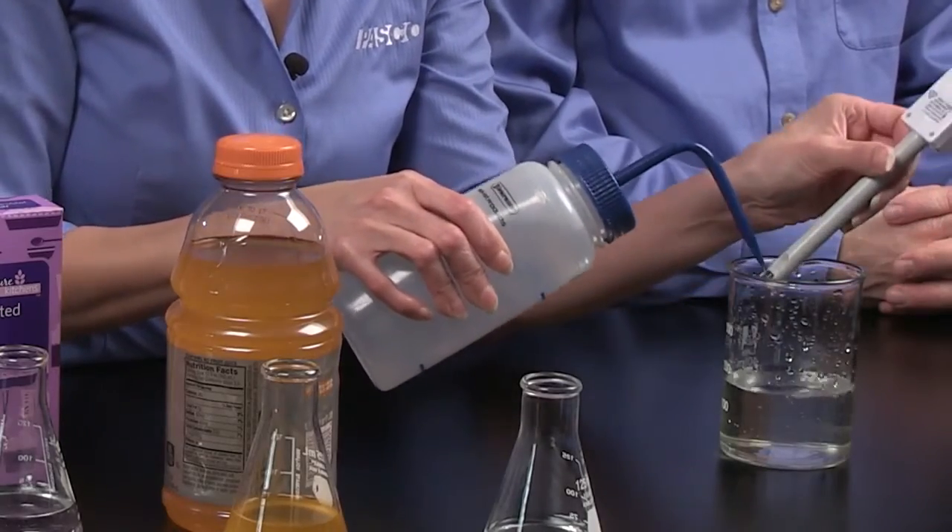I want to make sure I'm using conductivity on the y-axis, because I am going to measure the conductivity of those samples. Since I'm in a bar graph, it automatically sets up to manual sampling. It's always a good practice to clean the sensor before you use it with distilled water — just rinse the probe and don't forget to get inside. First, we're going to test distilled water.